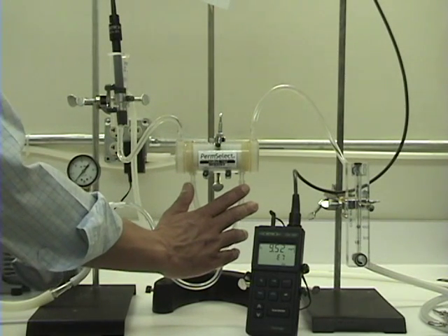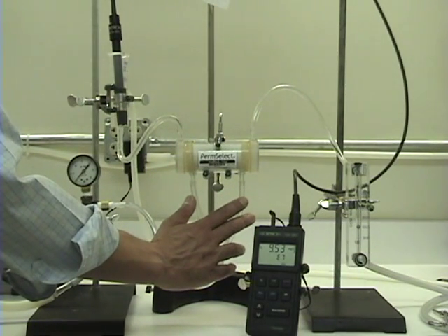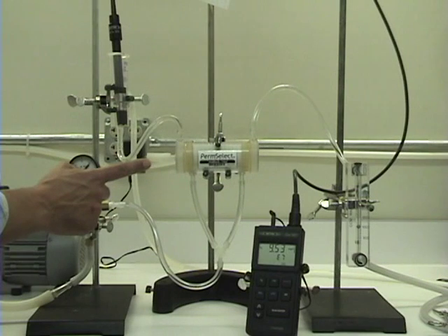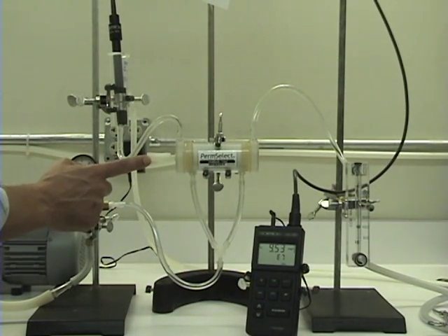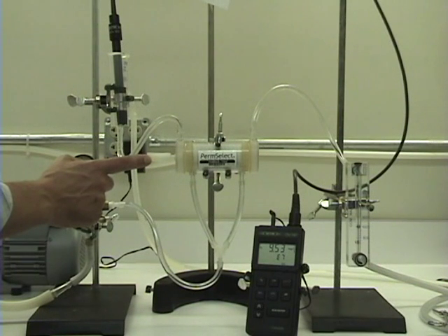Vacuum is applied to the shell side at these two bottom ports. The center port is plugged if no sweep gas is used on the shell side. Sweep gas may be used to reduce the potential for condensation.